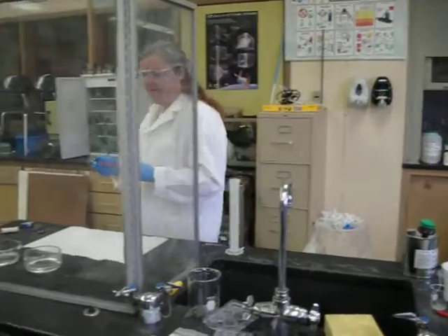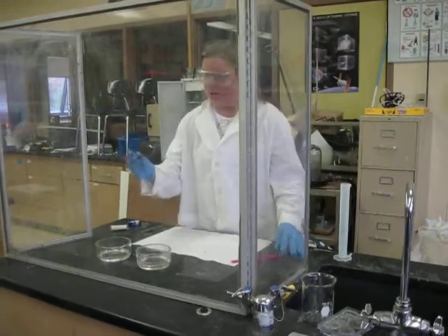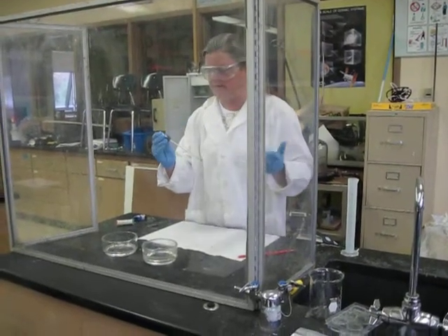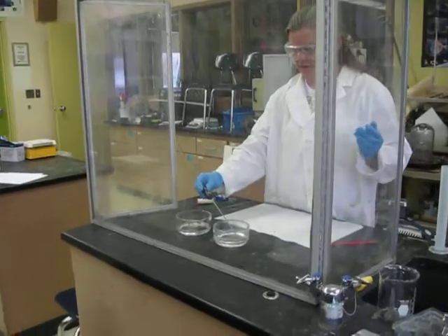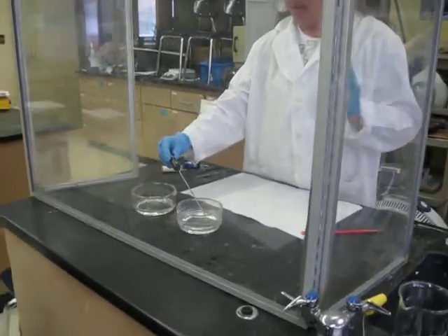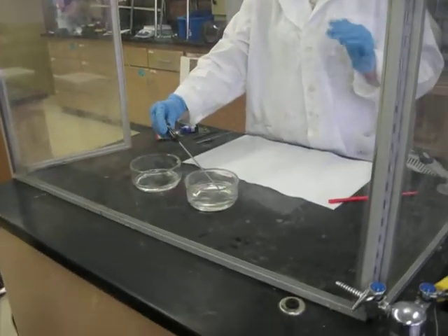Some information about the water before the chemical reaction happens. So I'm just turning on the thermometer, taking the temperature of the water. It's all very simple. And of course, we're going to start with lithium.